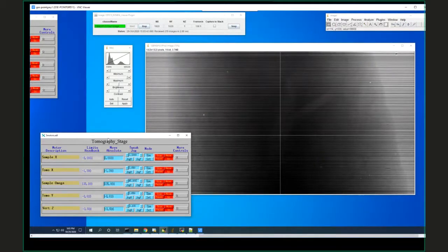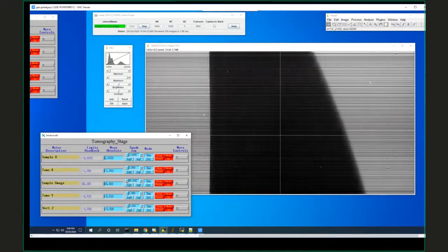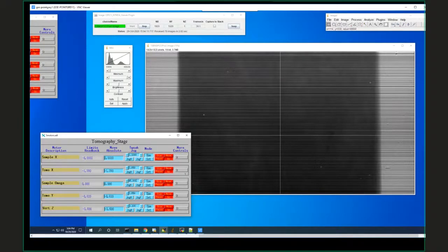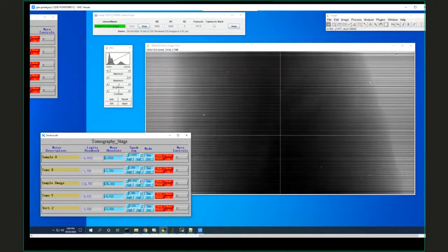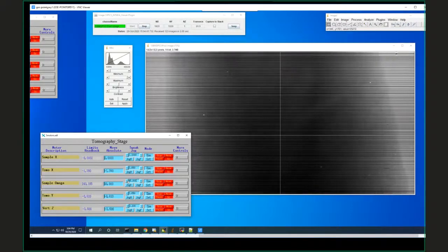We can see that the sample at 135 degrees is staying in the beam. I still have a little bit of air on the right and a little bit of air on the left. And if we go all the way to 180, it stayed in the beam. Zero, 90. It's a little hard to see the structure through all the stripes, but as it rotates, I think you can see what appear to be some big grains, like this bright thing here, something different from the material around it, looks more uniform. Yeah, that's a melt. So it's probably like a crystal, I'll bet. Yeah, this is MM501, the melt sample.